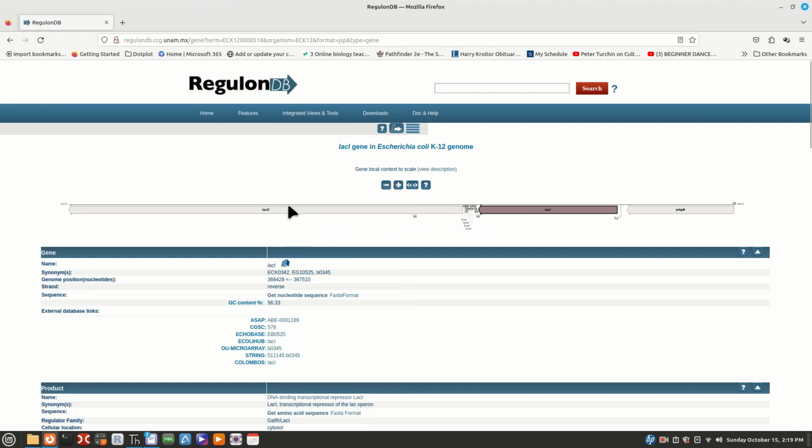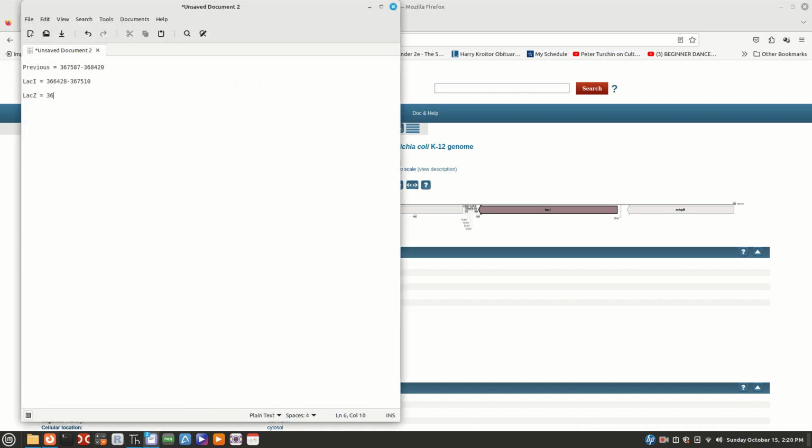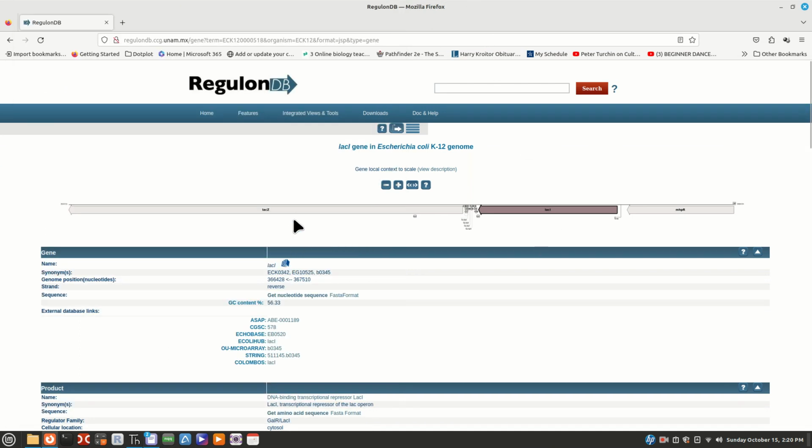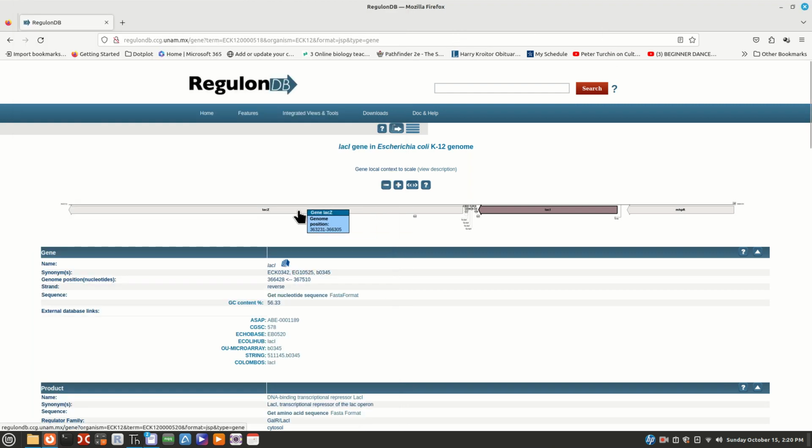I'm going to come back over here and go to lac Z: 363231. Then 366305. Let's see if I got that right. 366305. Yes.